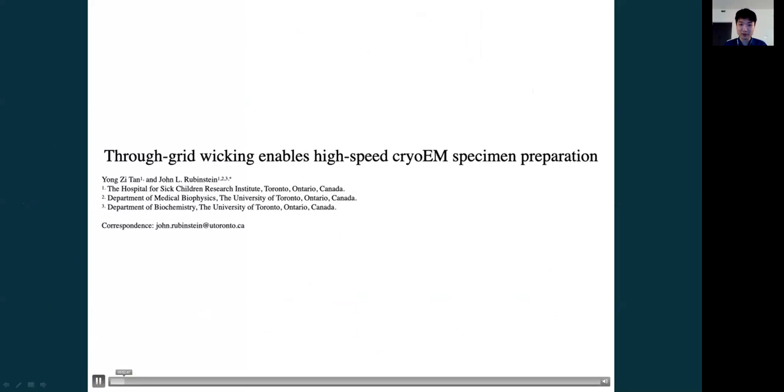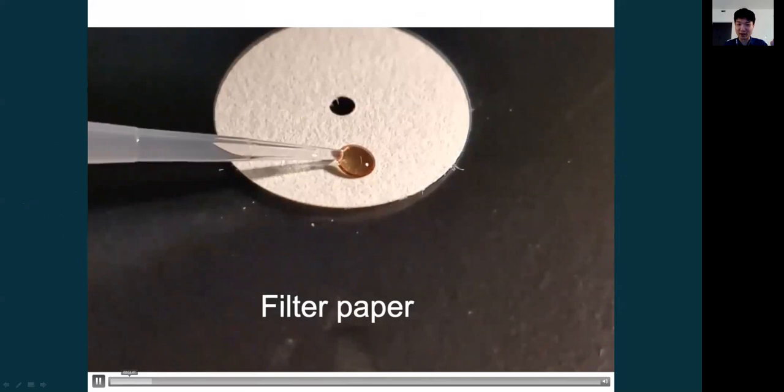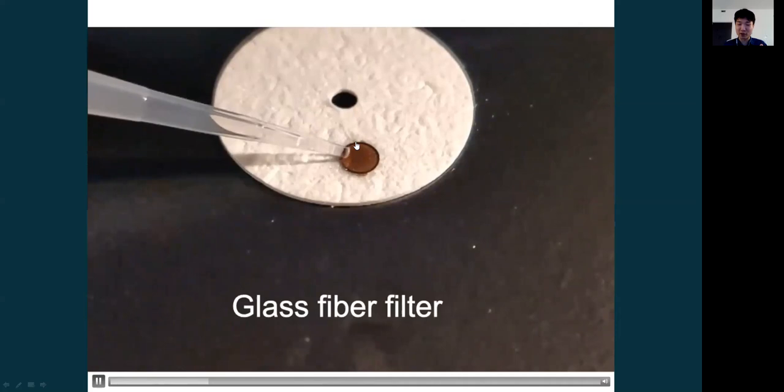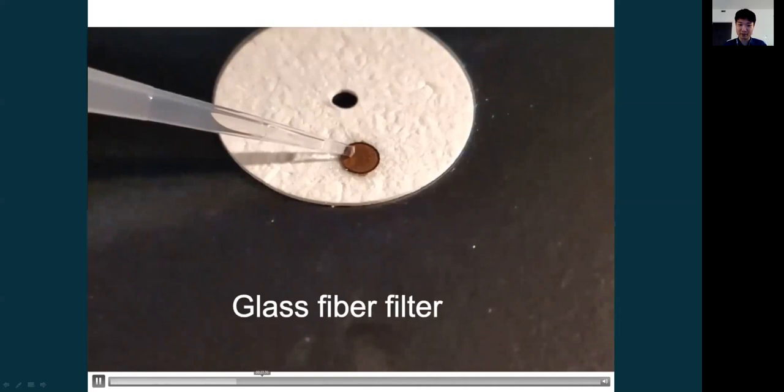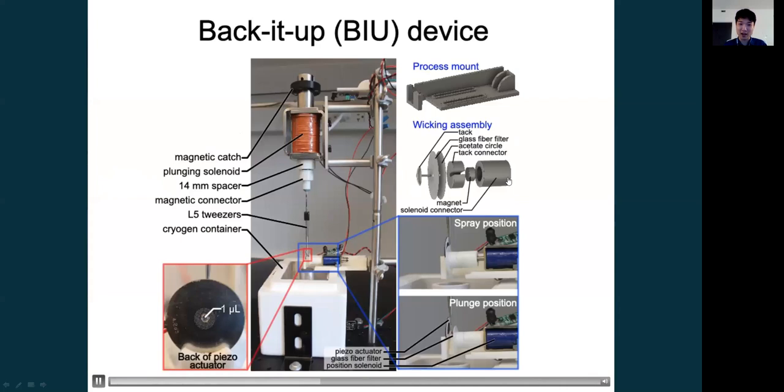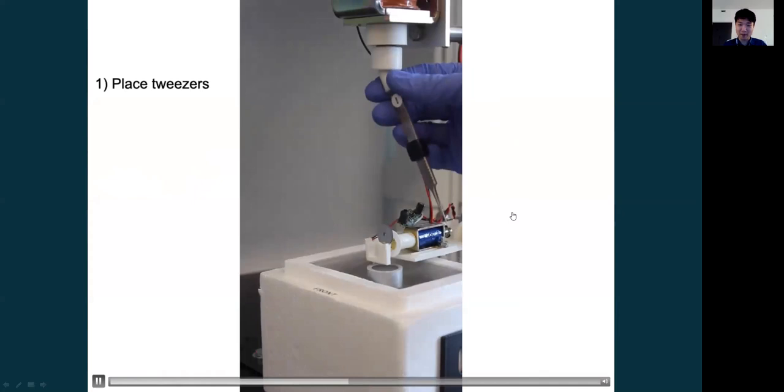So here's a summary of what I talked about earlier, in video format. So you can see that normal filter paper is not able to wick the liquid through the grid. What you need is, first of all, to glow discharge both sides of your grids for 2 minutes, as well as using a glass fiber filter paper. And that will allow for liquid to go through your grid normally. This will work for any conventional grid. And the idea is that by using the Back It Up, you can use the piezo to spray liquids onto the grid, and then the excess liquid will be wicked onto the filter paper, and then now you have thin film of liquid which can plunge. And this is the proof gallery of the Back It Up device.